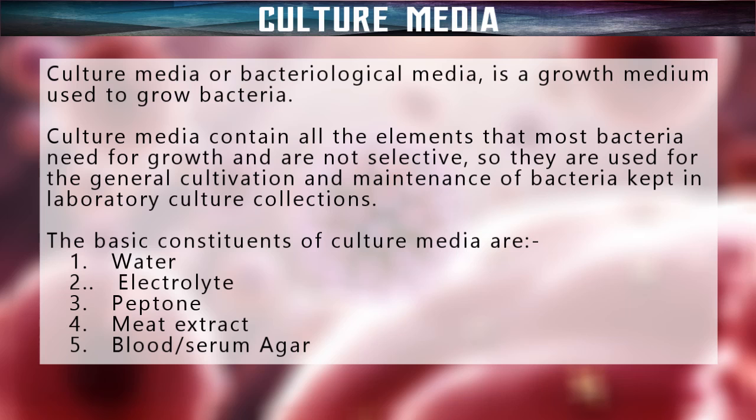It is through the use of a bacterial culture media that the presence of a bacterial infection is either confirmed or not. Although there are other ways of doing so, growing microbes is the most accurate method. In simple words, unless microbiological media existed, actually confirming a disease would be incredibly difficult.